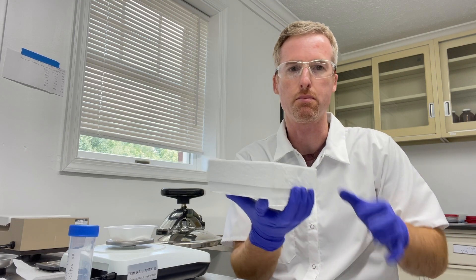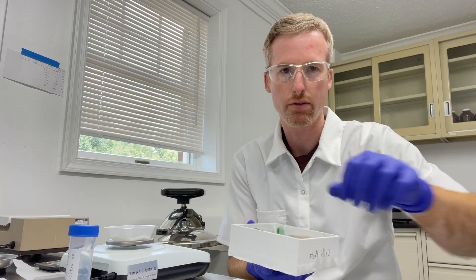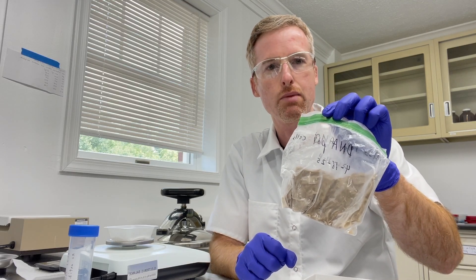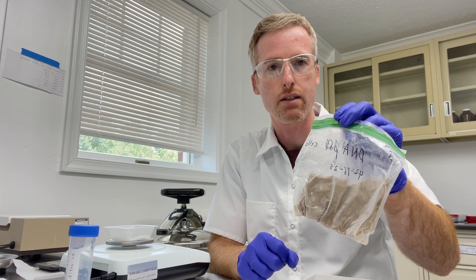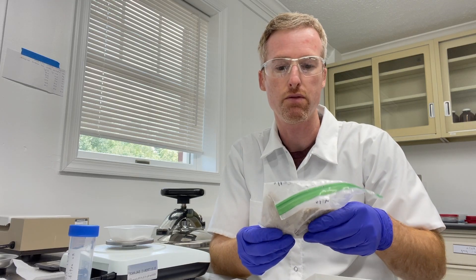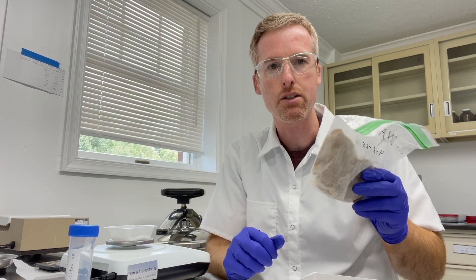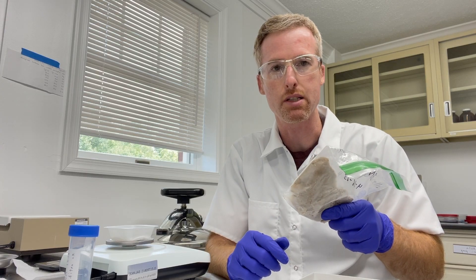So here I have some E. coli cells that I grew previously. I like to store my E. coli in freezer bags, because it's very convenient and affordable, it fits perfectly in a freezer box, and also I don't have to thaw all of these cells at once like I would if they were in the same tube.